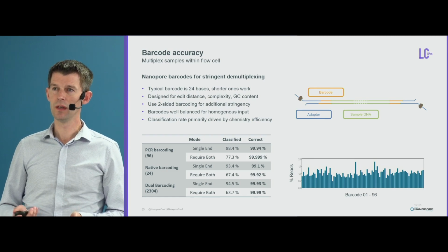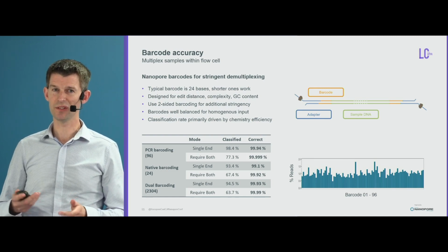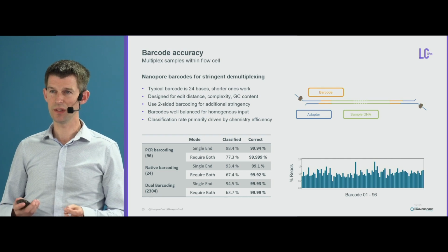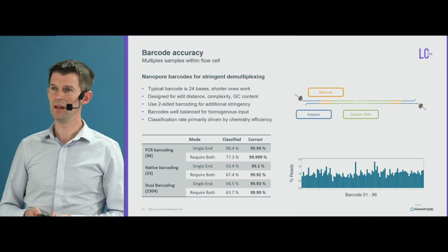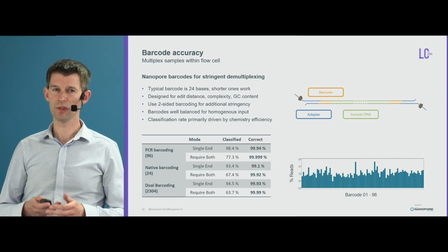And if you're going to use more than one read to make any sort of decision based on your data, it's incredibly unlikely you're going to get that wrong, and you're probably dwarfed by anything that can happen upstream of our informatics.